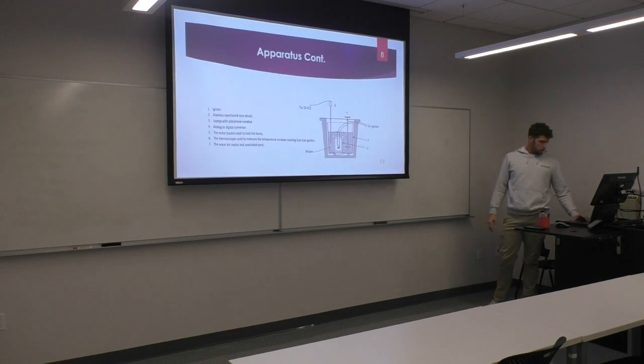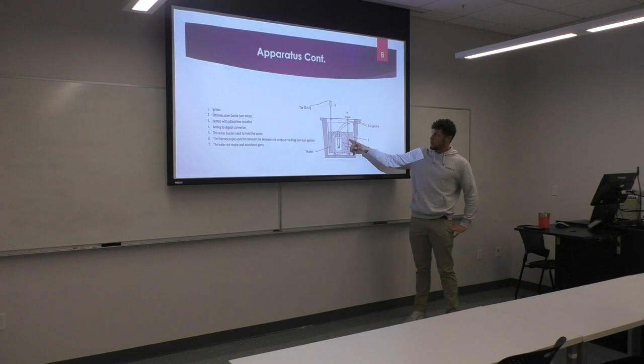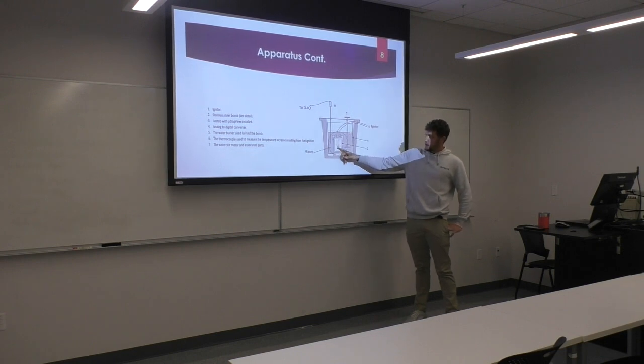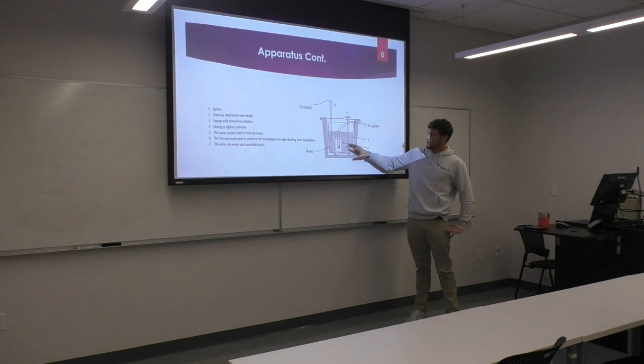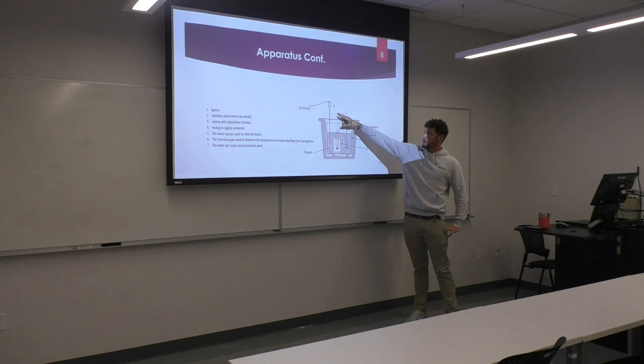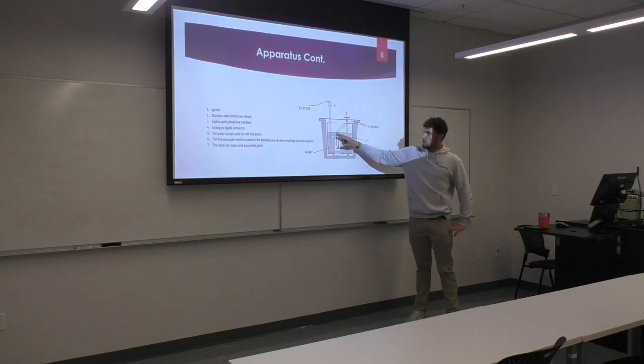And then when you finish putting that together, you're going to drop the entire thing in an insulated bucket full of water. The water is what you're going to be measuring the temperature of. Your combustion happens in here, it heats up, that heat transfers to the water to change the temperature that you're measuring and using to find all these values. And you're going to use a stir stick to make sure that the temperature is evenly distributed throughout the water.